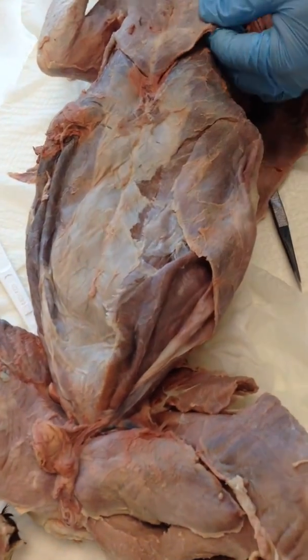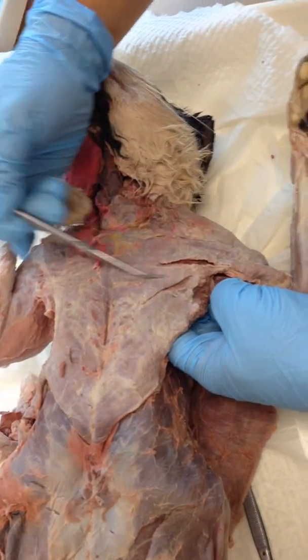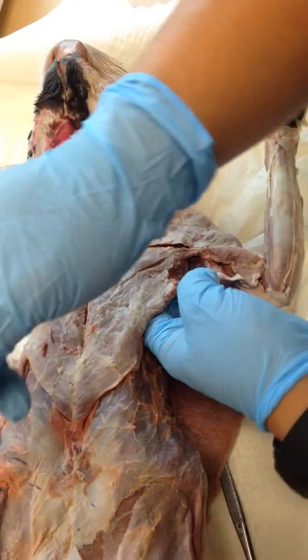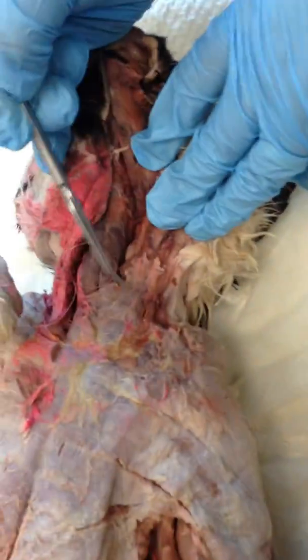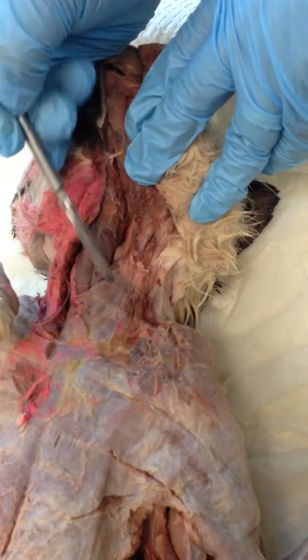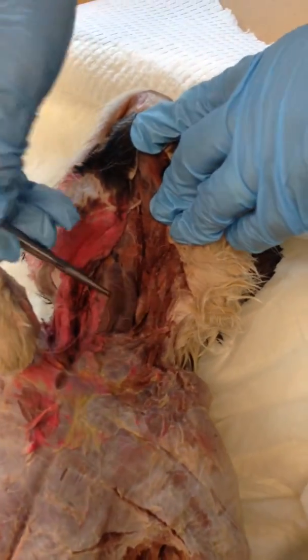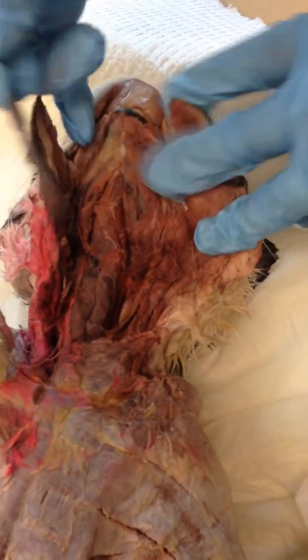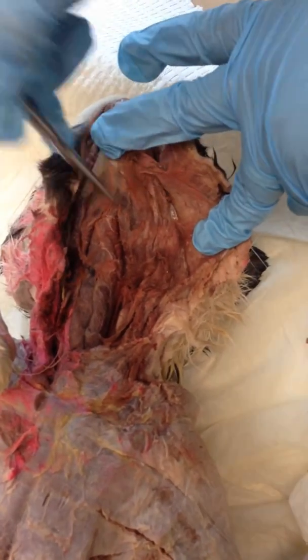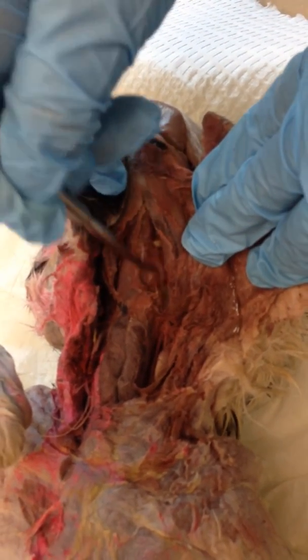And this is, like I said, the pectoralis minor. This one is the pectoralis major. So major, minor. Muscle fibers teased, so you're just seeing some skeletal muscle. Sternomastoid is this one. Sternohyoid, this one right here. Digastric muscles right here, this bifurcation right here. And the mylohyoid is deep, which is the floor of the mouth right here. Mylohyoid. And that's our cat.